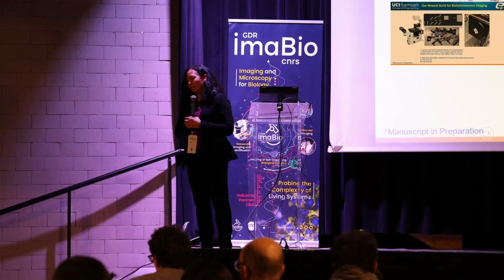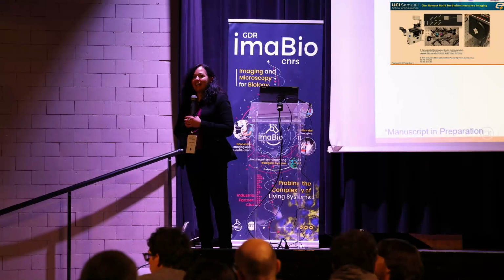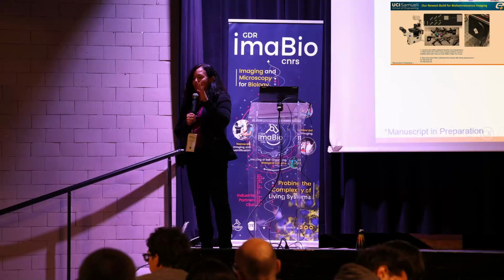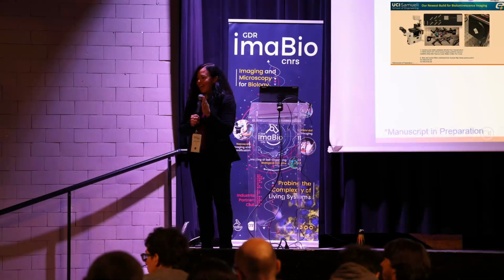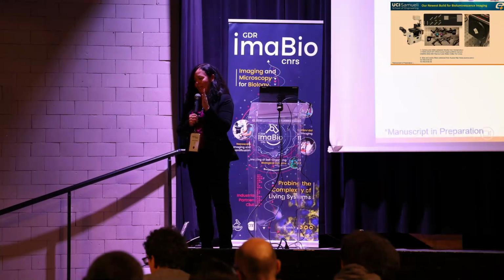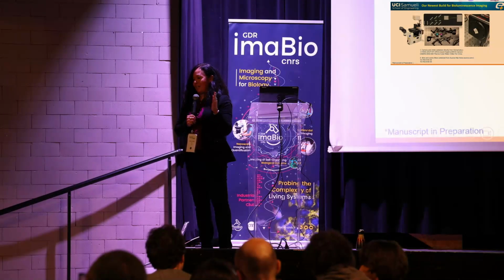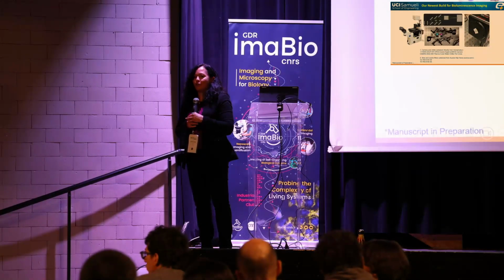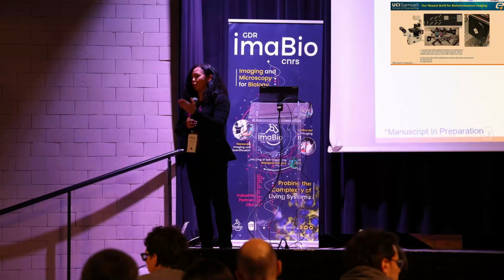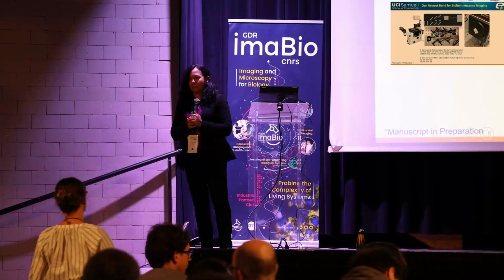And what happens if the lifetime's not mono-exponential, as many are not? Yeah. So those lifetimes, as long as you fingerprint what you can identify, that particular lifetime with that excitation, right? So we use a specific excitation. If you want to excite FAD, you look at the NADH FAD ratio. So there are different wavelengths for different fluorophores of interest, and there are many fluorophores that you can look at. We only looked at NADH in those examples. Yeah.